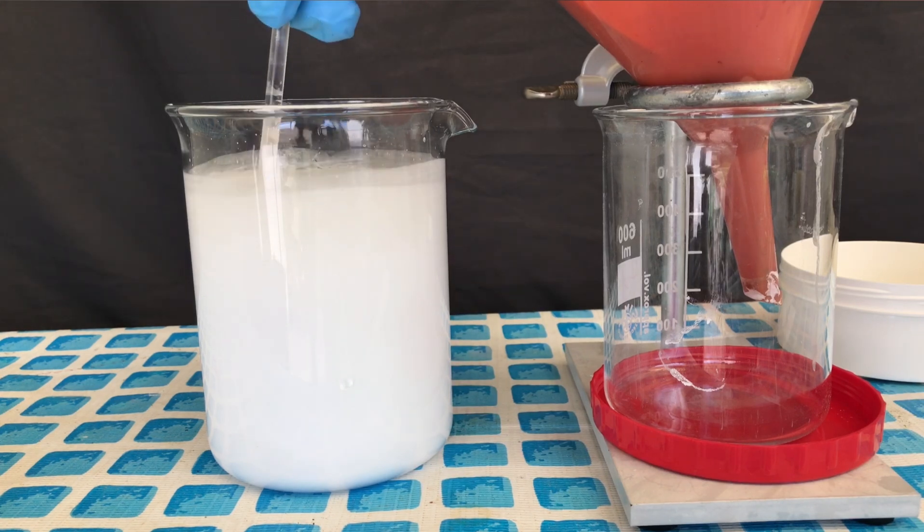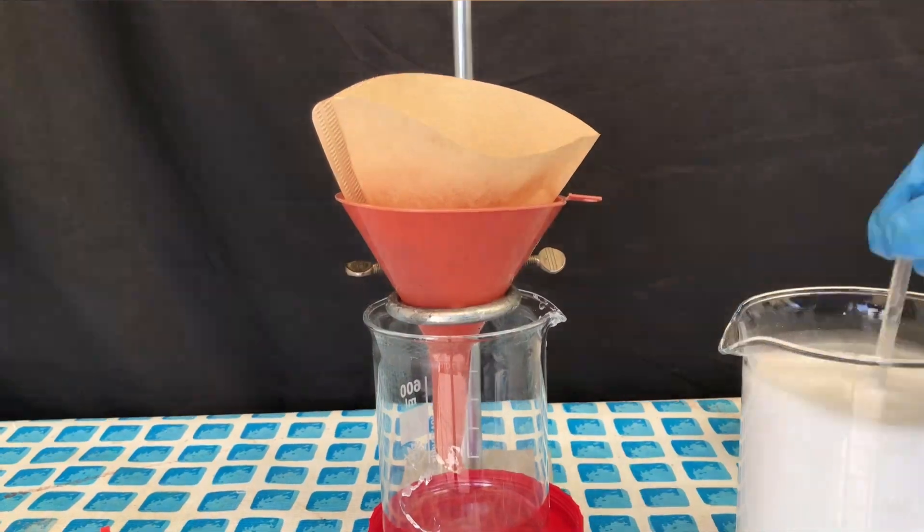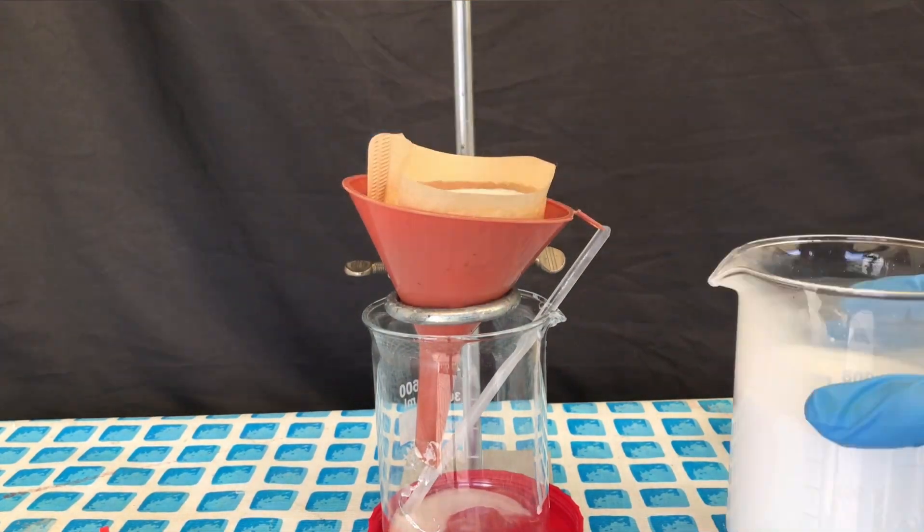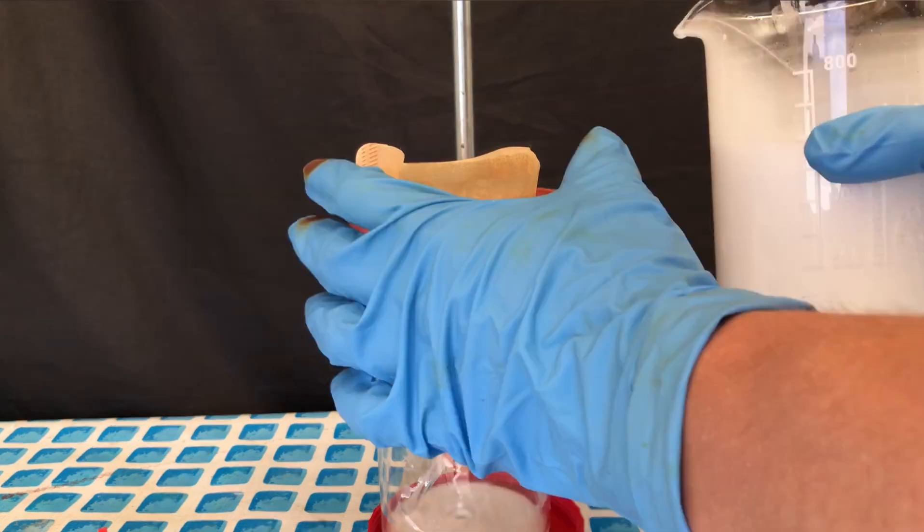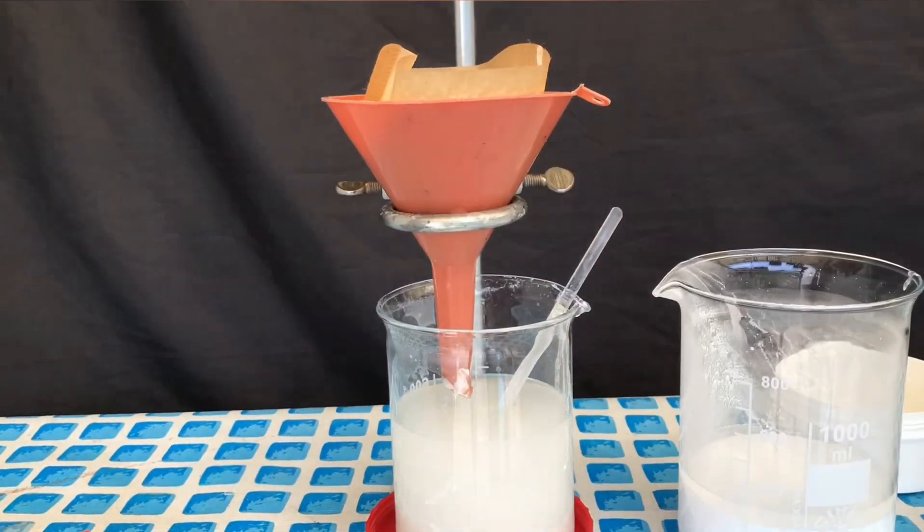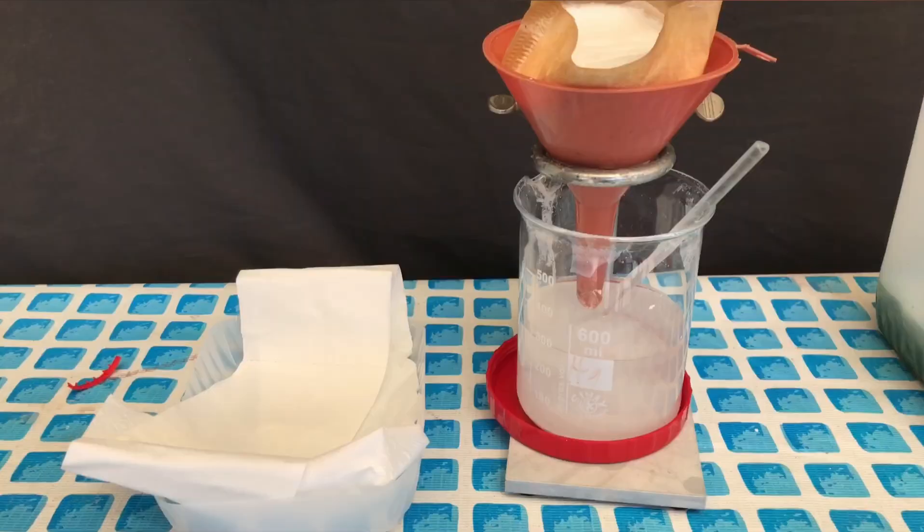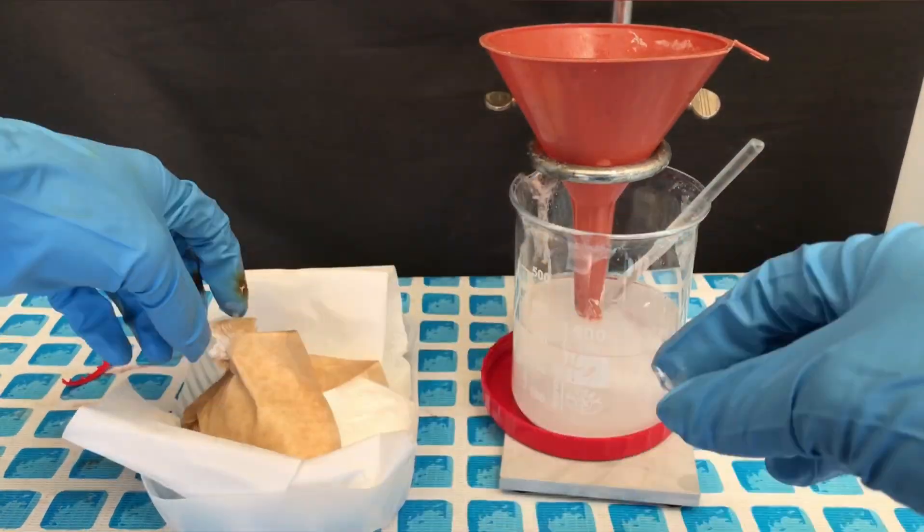The solution was diluted a couple of times and afterwards a gravity filtration was performed. The gravity filtration turned out to take longer than expected but it worked out. All waste solution and all waste was transferred to a canister with water soluble and not water soluble lead waste.